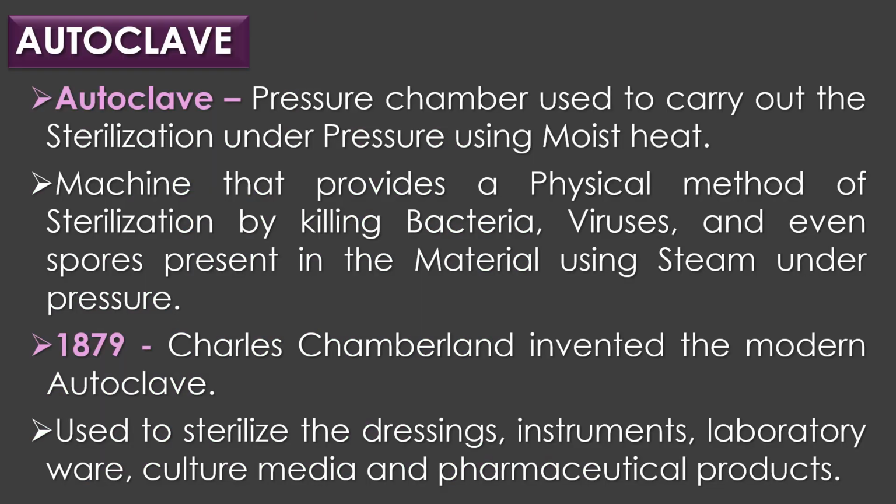Autoclave. An autoclave is a pressure chamber used to carry out sterilization under pressure using moist heat. An autoclave is a machine that provides a physical method of sterilization by killing bacteria, viruses, and even spores present in the material put inside of the vessel using steam under pressure.